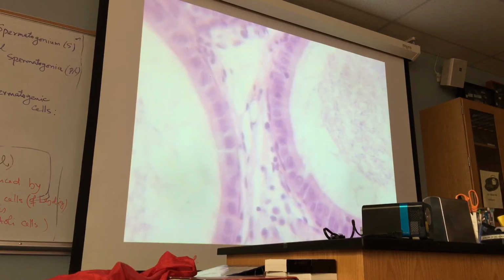So what do the microvilli do here? Microvilli function is to increase the surface area. Surface area for what? For absorption. Absorption of what? When the sperm are not expelled, they degenerate and are resorbed by the microvilli, by the stereocilia.